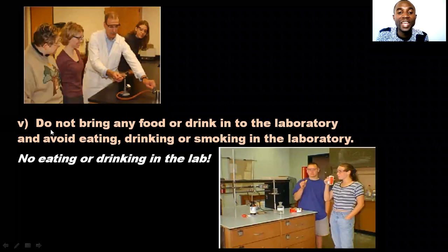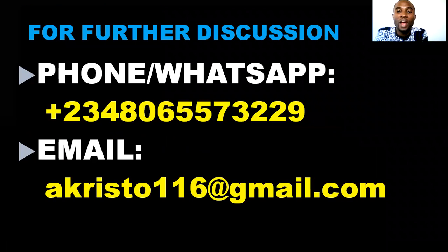Do not bring any food items. The way these people are eating in the lab is not good. Do not eat, do not drink, and avoid smoking in the laboratory. No eating, no drinking in the lab. Lab means laboratory. We don't permit that. All right, that is what we have talked about so far.